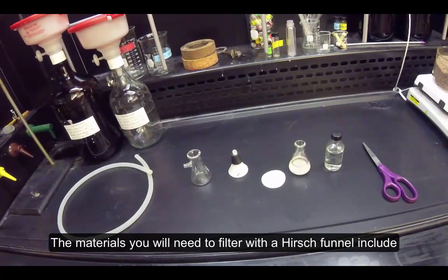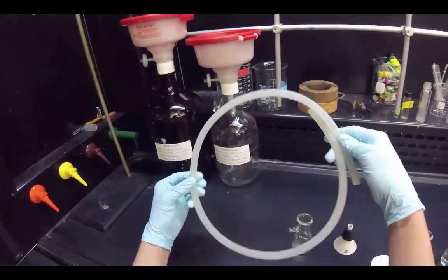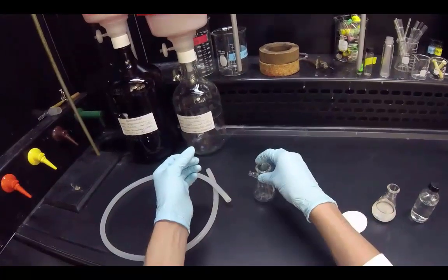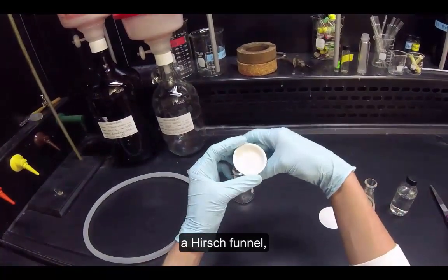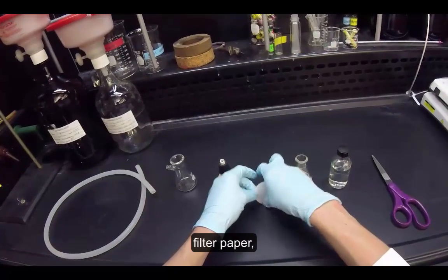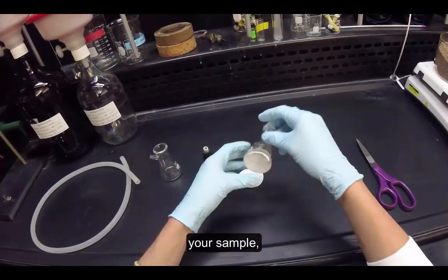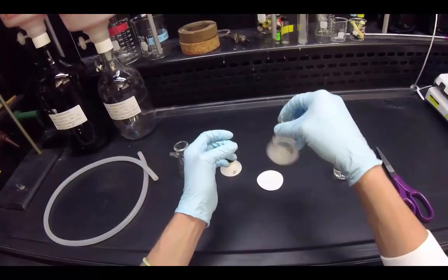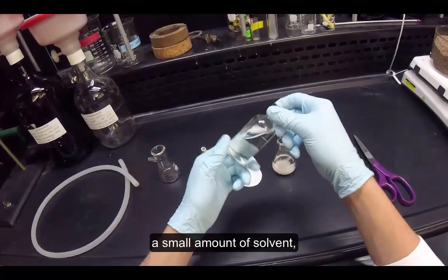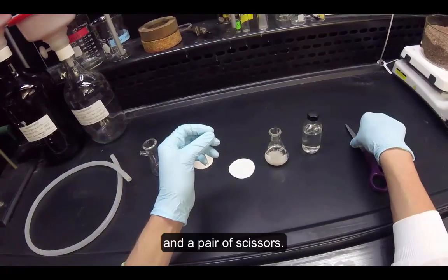The materials you will need to filter with a Hirsch funnel include a vacuum hose, a filter flask, a Hirsch funnel, filter paper, your sample, a small amount of solvent, and a pair of scissors.